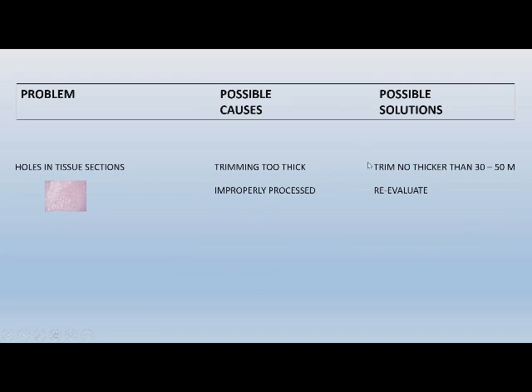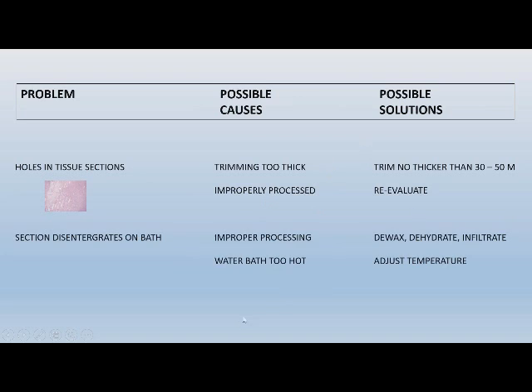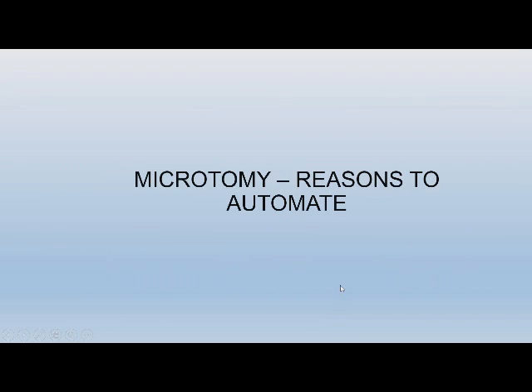Holes in tissue: trimming too thick, improperly processed. Sections disintegrating on the water bath: improper processing. You need to go back and do some reprocessing. Water bath too hot, adjust temperature.